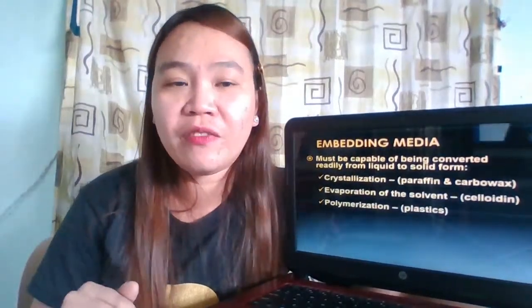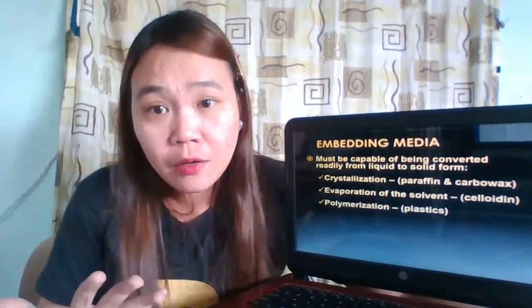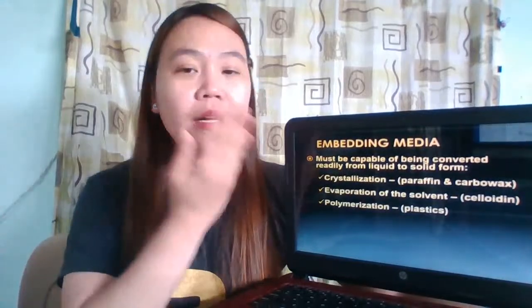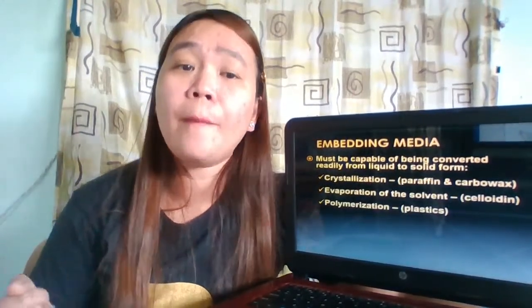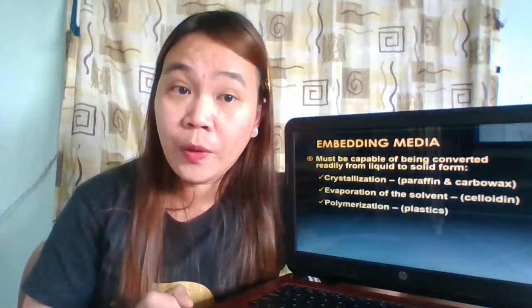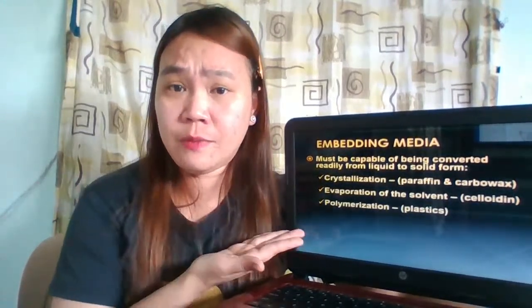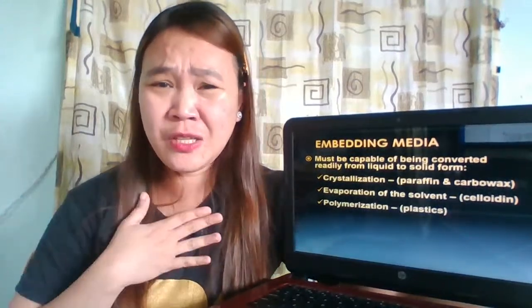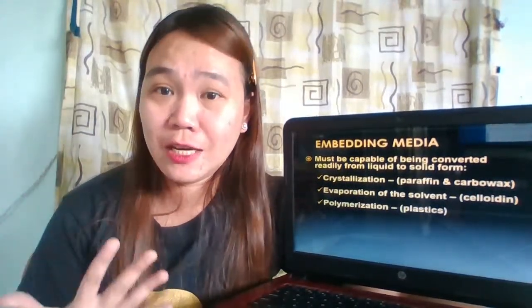I hope everything is clear to you. Depending on the medium that we are talking about, there are several mechanisms involved in the conversion of your embedding medium from liquid to solid. First, let us discuss the first mechanism. The first one is crystallization.